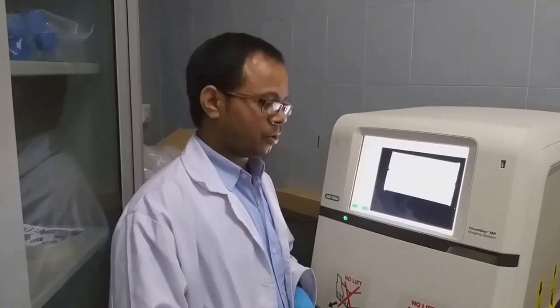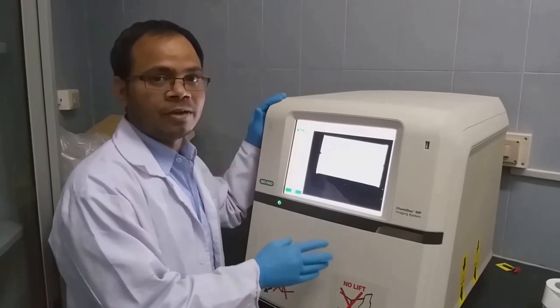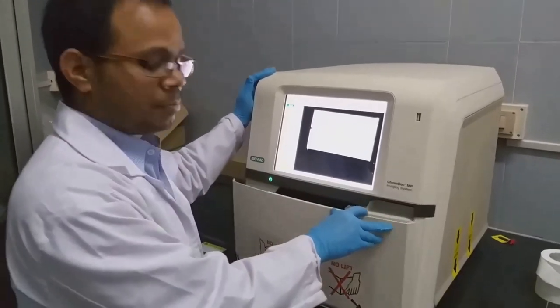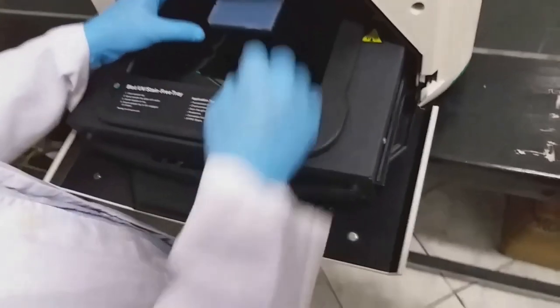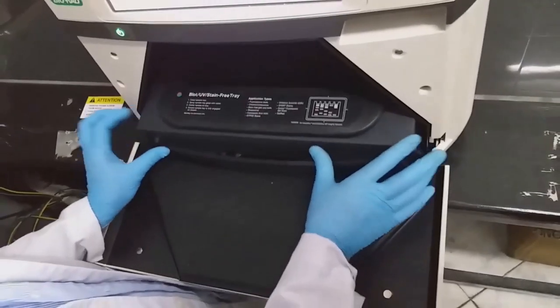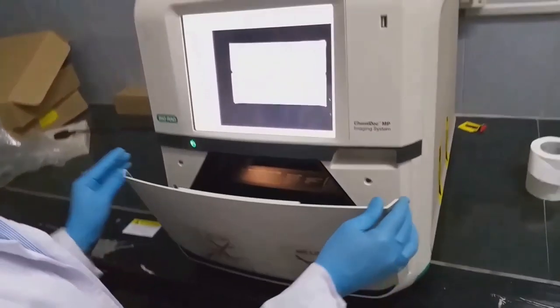After the agarose gel electrophoresis, we have to visualize the amplified product. This is the ChemiDoc MP, where we are going to visualize the amplified product. Now we have to keep the gel and close the door.